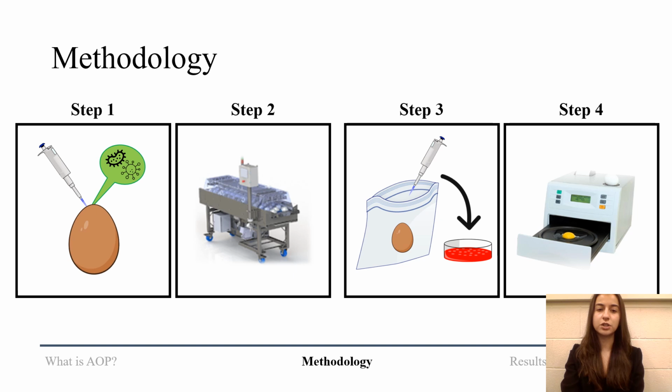To assess the technology's impact on the quality of the egg, samples were tested over a 35-day period to mimic the shelf life of the product. Here, yolk color and the Haugh unit were evaluated as important egg quality metrics.